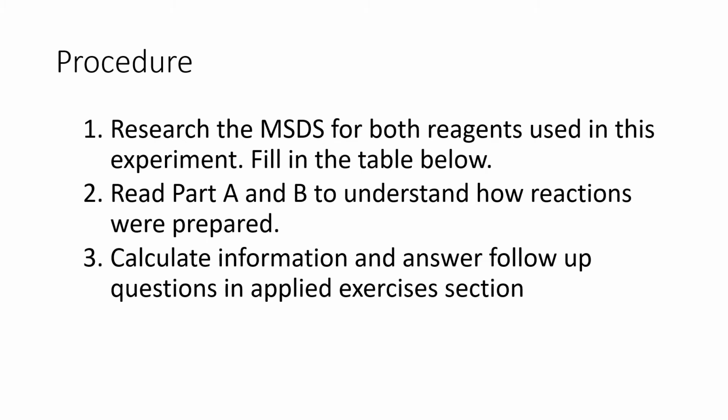In terms of what we're actually doing for this lab, first you're just going to do the usual: research the MSDS for both reagents, fill in that table, read part A and B carefully to understand what exactly is going on, how everything was prepared, and then part 3, calculate information and answer follow-up questions in the applied exercises.